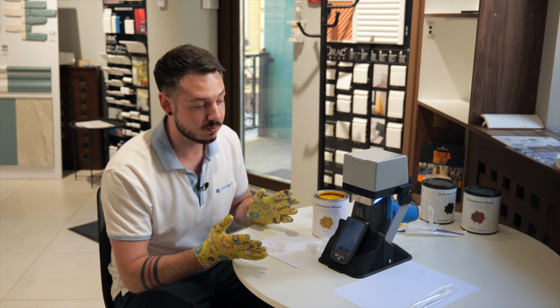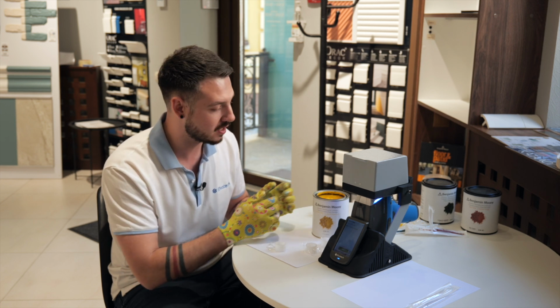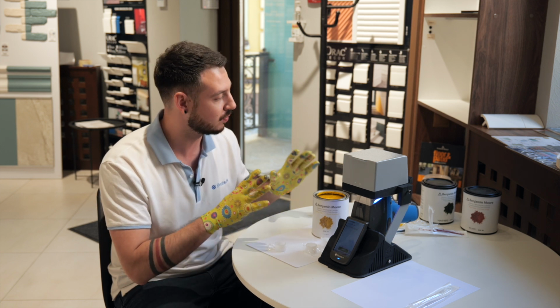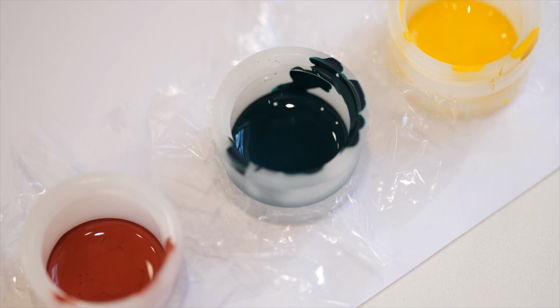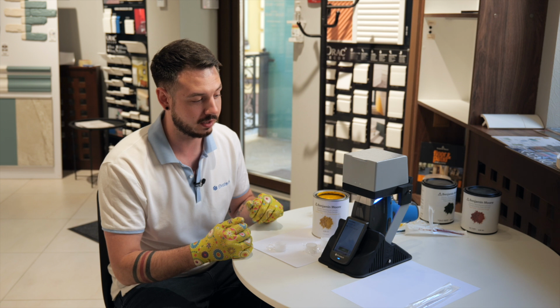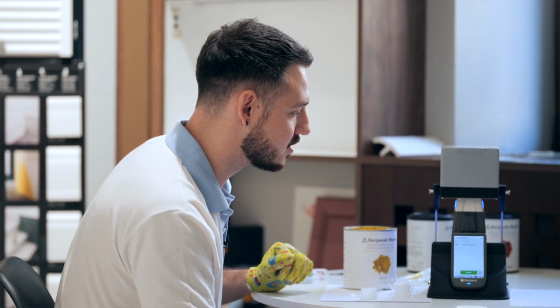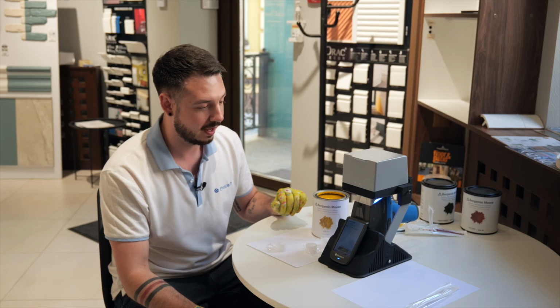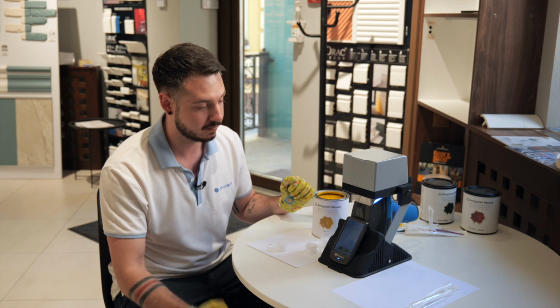So it's better than our two previous samples, but actually it doesn't say a lot because all of these 3 samples are absolutely good and going according to all regulations, if we're gonna talk about RoHS or about EPA. So here we have results. All colors are good, all paints are really good, and they can be used for both exterior and interior painting.